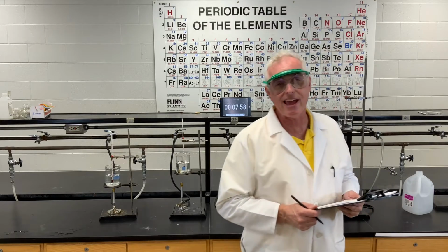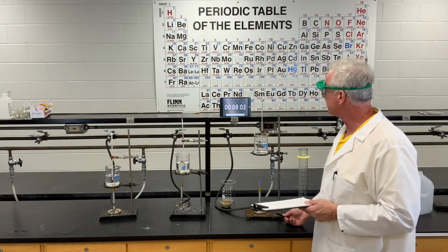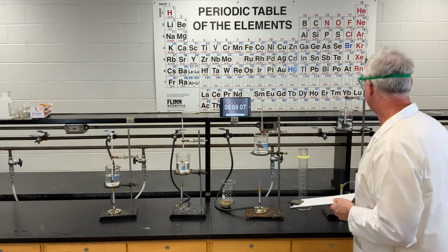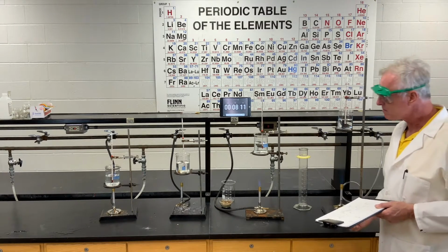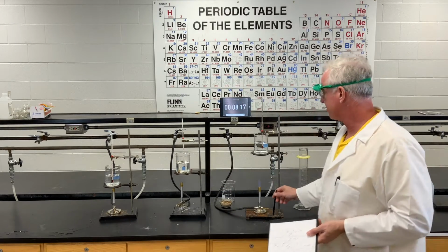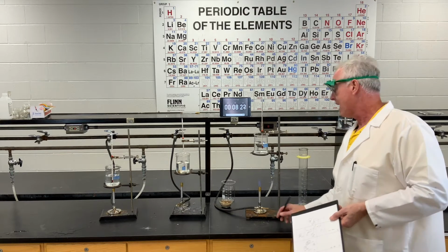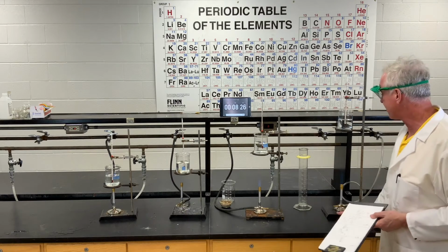Okay, folks, we are 8 minutes in, and height number 3 is only up to 47 degrees. And height number 4 is only up to 40 degrees. Typically, having run this lab for several years, this one will take between 10 and 15 minutes to reach temperature. And this one, if it ever reaches temperature, usually doesn't get there till about 25 minutes.